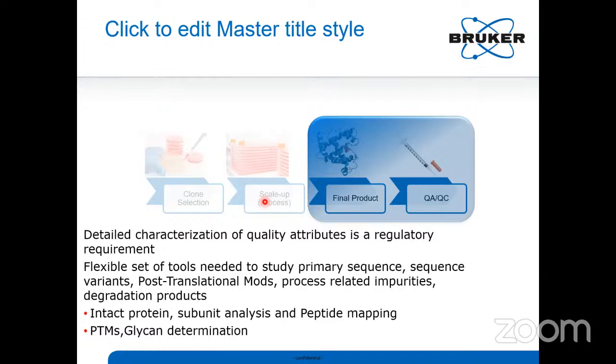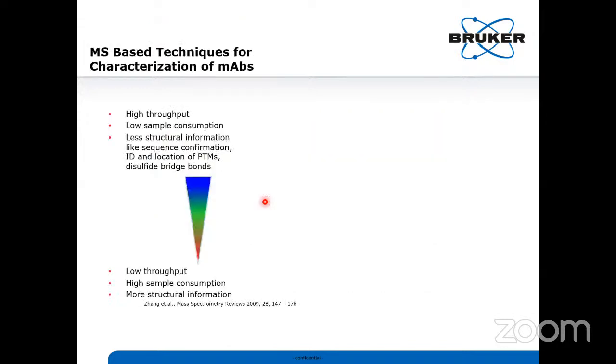But once you introduce it to bulk fermentations, high cylinders like 1000 liters, 2000 liters, there is a chance, because of foam formation, that other quality issues may happen. So in every step you need mass spec to confirm your sample.